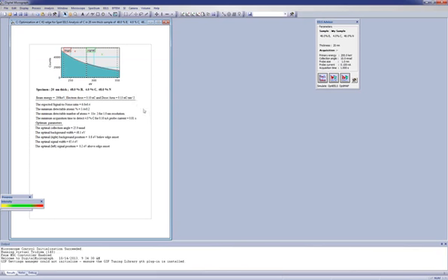And for these optimized conditions, it gives the expected signal-to-noise ratio, the minimum detectable atomic percentage at 3.4%, the minimum detectable number of atoms at 33, and the minimum acquisition time to detect 4% carbon for this current is 0.81 seconds. The optimum parameters: it gives the optimum collection angle at 26 milliradians, the optimal background width, once we've grabbed the spectrum, of 48 eV, and the optimum signal width of 65 eV.